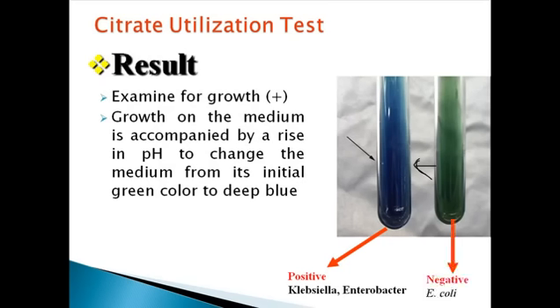So these are the different sets of reaction steps that we can go through to determine what we end up with, whether we have a sample of Enterobacter genera, and whether we have a sample of fecal coliform or not.